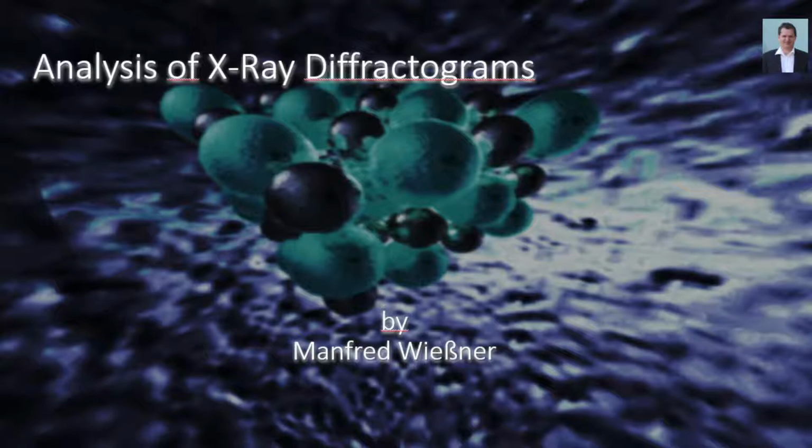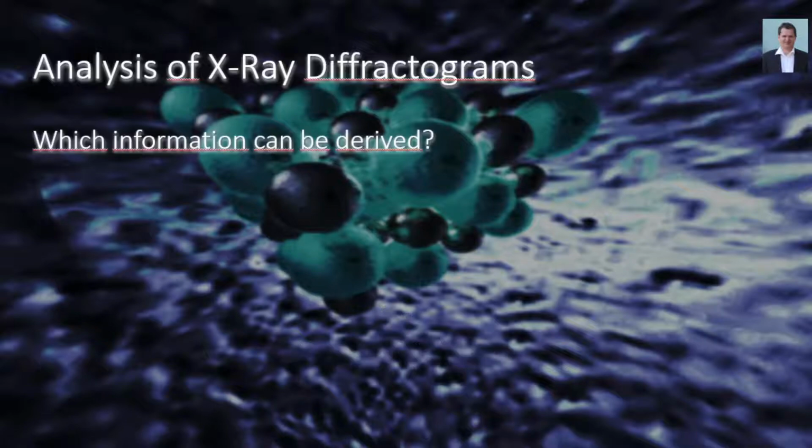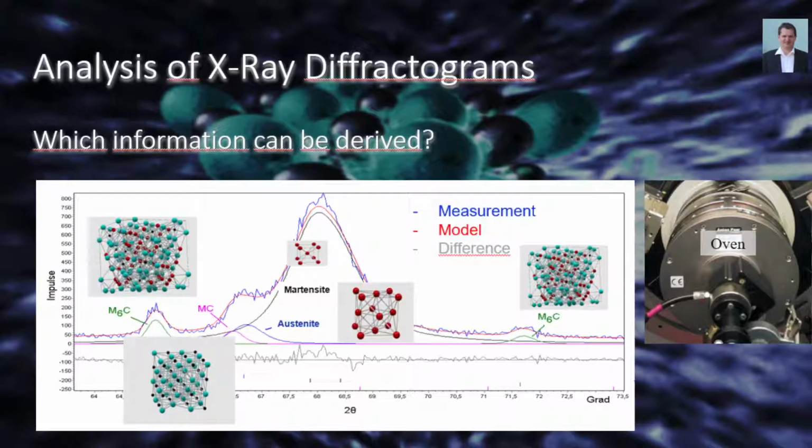So, the channel is about X-ray diffraction analysis techniques. In this video I would like to answer the question: what can I read out from the diffractograms? What do the diffractograms say about my examined material? To answer this question, I would like to create a short video now.